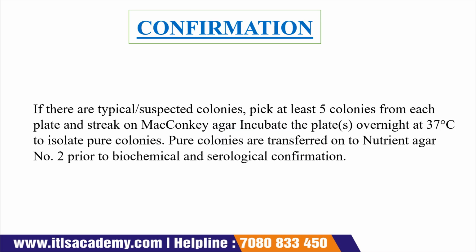Okay, so the confirmation test will be performed. If there are any typical suspected colonies, then we pick up 5 colonies from each plate, and then we streak them onto a MacConkey agar.